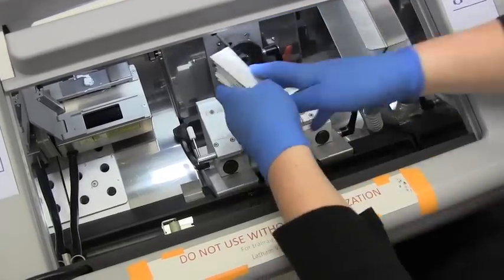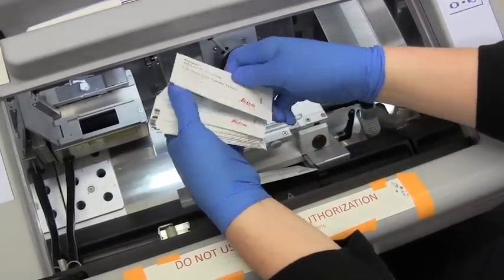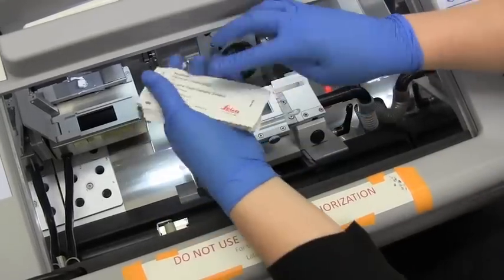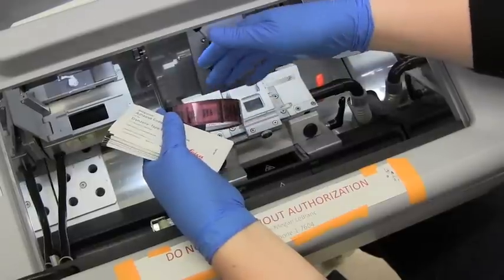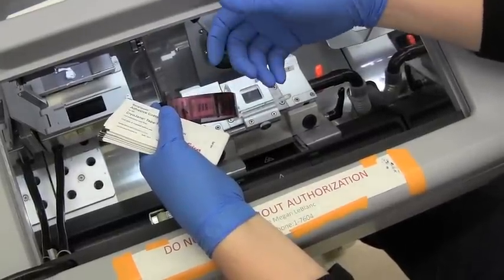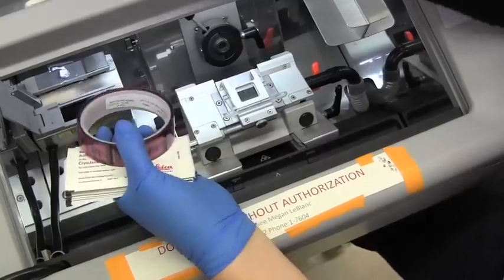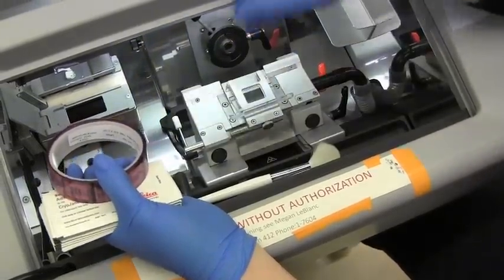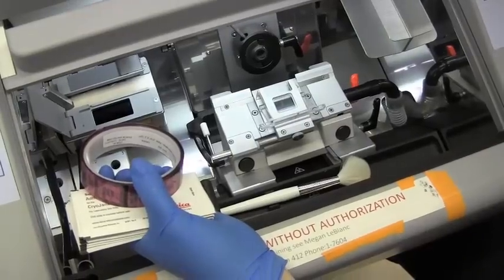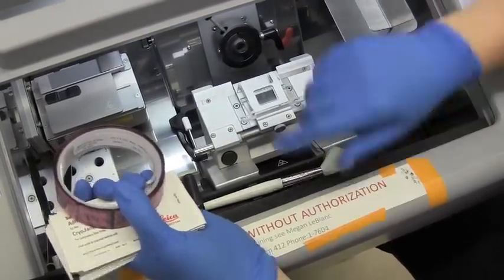We can take the slides out. Slides can be defrosted and frozen multiple times — it doesn't really hurt them. The tapes, if you leave them in the freezer and refreeze and defrost them a few times, they lose integrity and are not really reusable. So everything else comes out. Put our roller back, take our sample out, and everything should be ready for the next user or for hibernation.